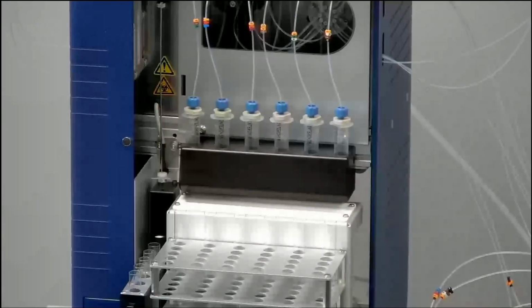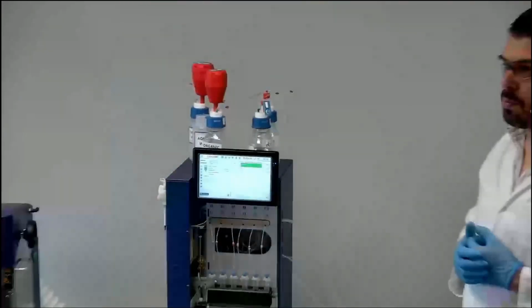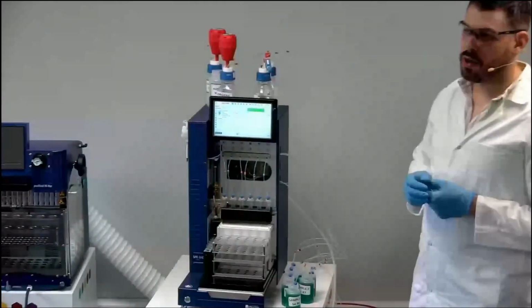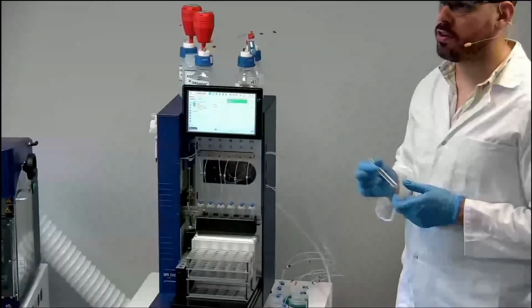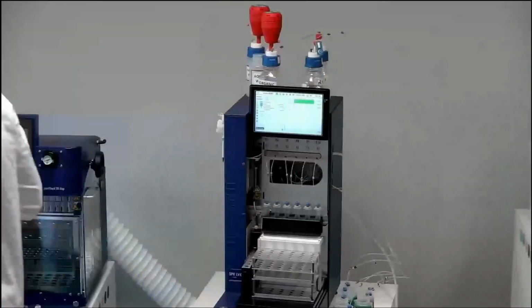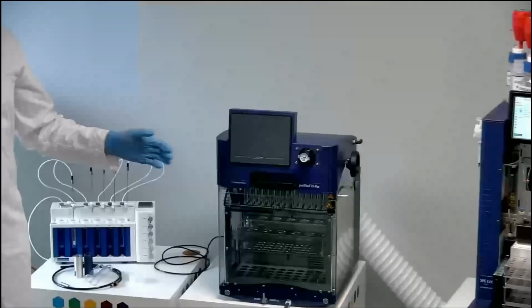Once I have finished my elution fractions, we have other possibilities, because when you finish your collections, often you have to evaporate your collection tubes. So you take your test tubes, and here we have different possibilities to evaporate your elution fractions.